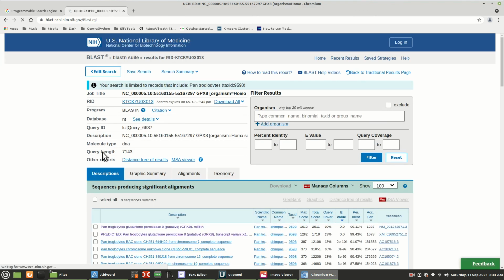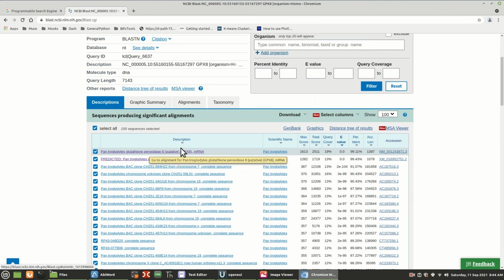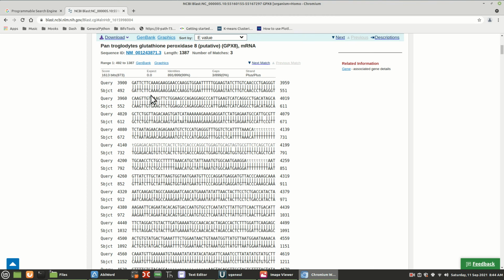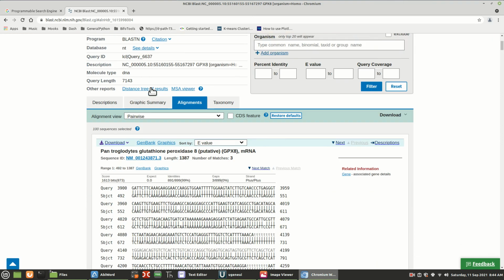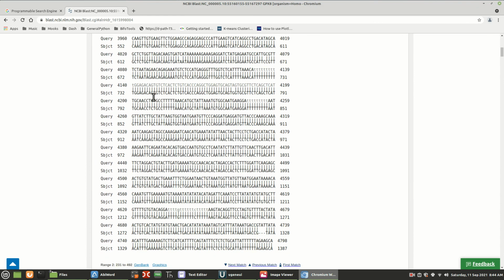Here we go. All right, so we chose this first one. If I click here, we clicked here and got the sequence, but we didn't look at actually how the alignment went. So when I click right here, it's going to move us down, further down from up here. Or, actually, it didn't, it gave us a whole new page. But this is the alignment.